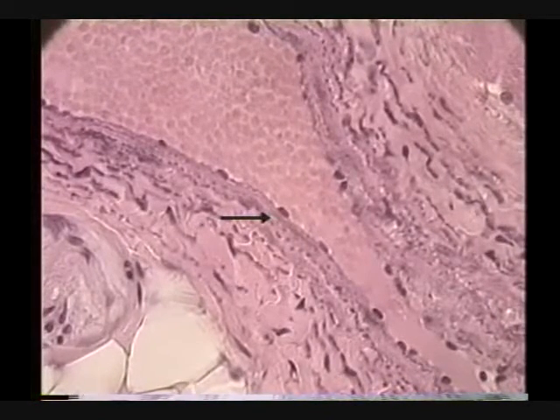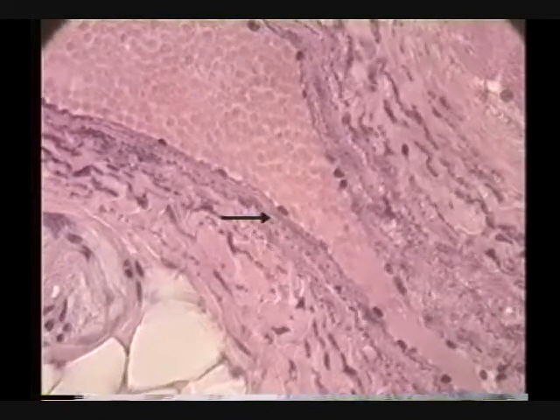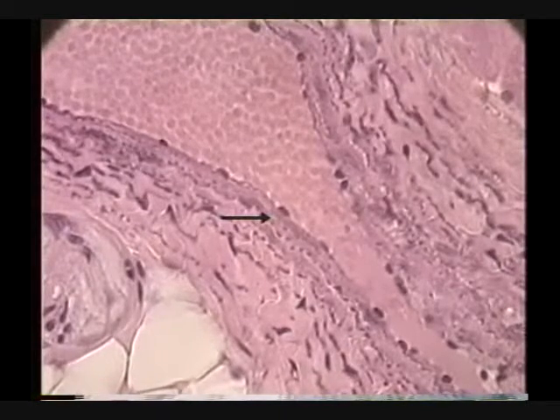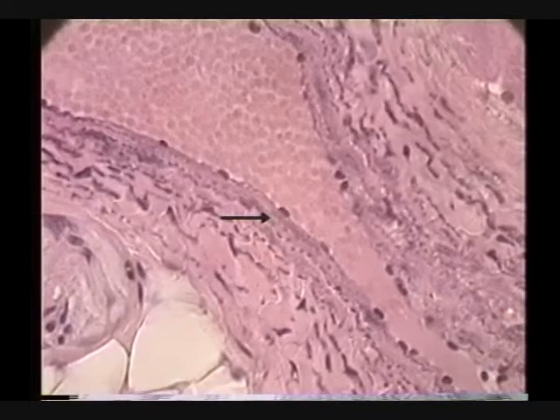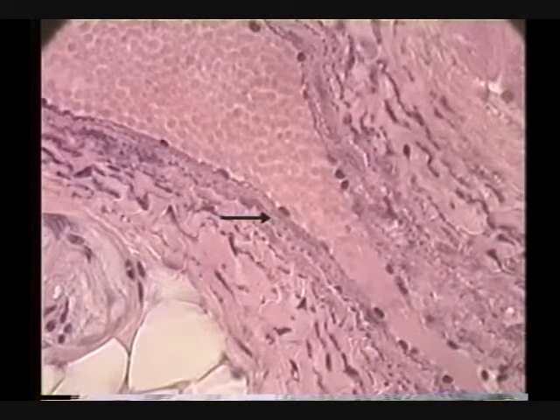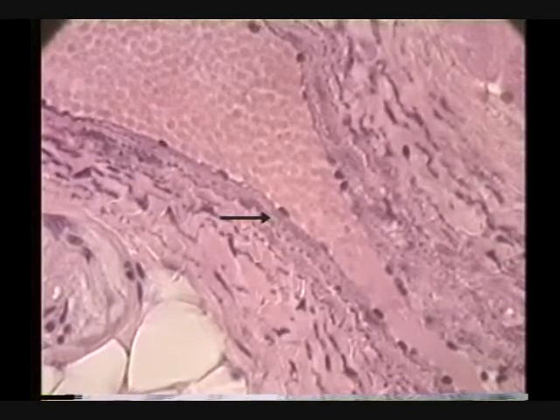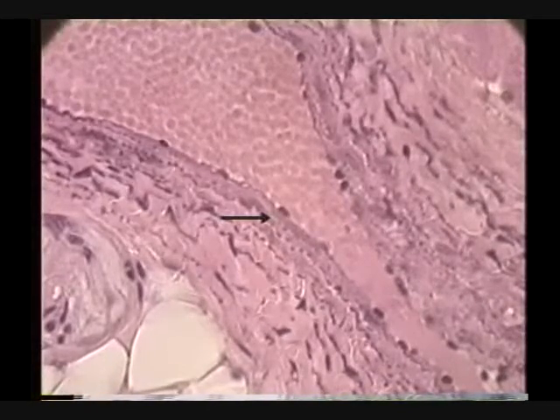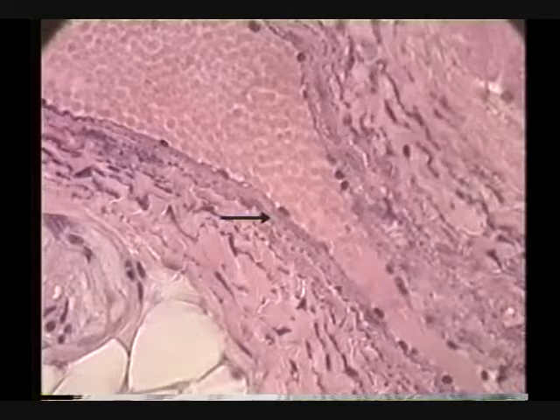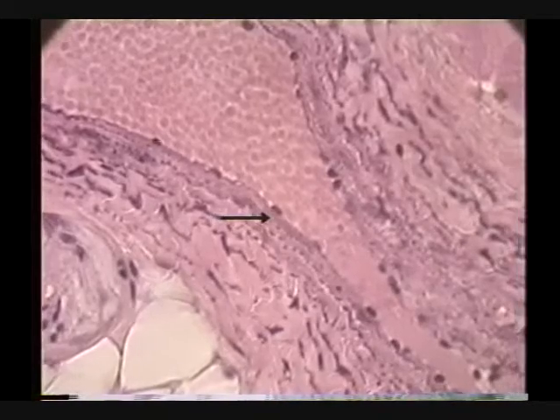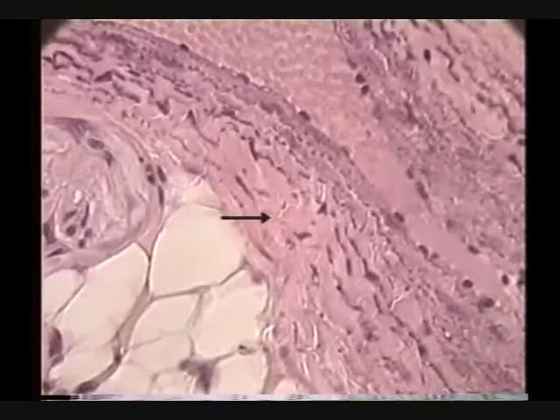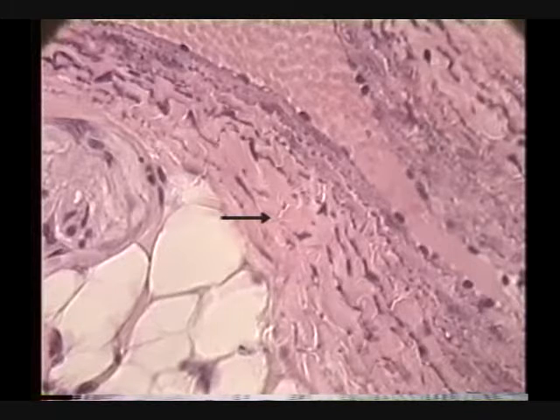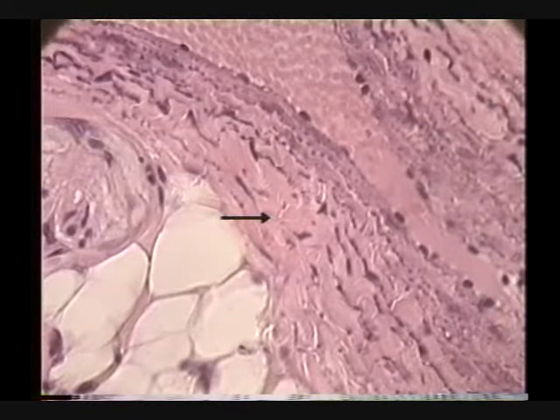What tissues can you see in that tunic? There's a little bit of smooth muscle in there - not much, a tiny little bit - and probably some connective tissue. That's the tunica media. And then out here is the tunica adventitia, or externa.